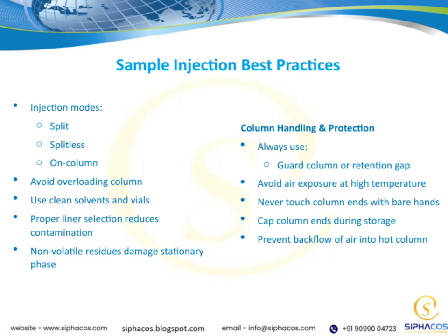Now, moving on to sample injection best practices. You have different injection modes to choose from: split, splitless, and on-column. Selecting the right mode depends on your sample and analytical needs. Be cautious not to overload the column. Overloading can lead to poor separation and reproducibility issues.